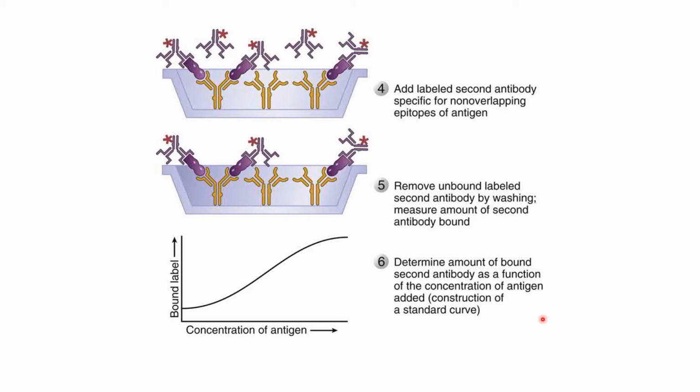The reason we do this is that in the end, we will run our plate in an ELISA machine. And that machine doesn't detect the antigens directly. Instead, it detects your secondary antibody because that's where your fluorophore is. The fluorophore is a chemical fluorescent. So think of it like the shiny part of your antibody-antigen complex. So it's the part that your ELISA machine can see.